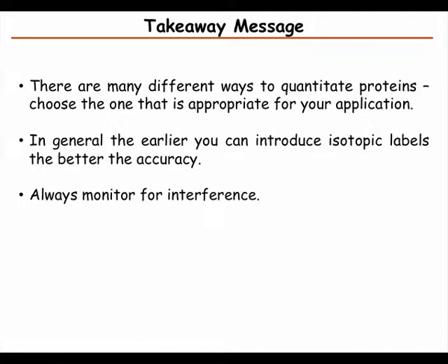And so to summarize in a different way, there are many different ways to do quantitation, and some are more appropriate for some applications than others. It's also often a question of cost and time, how long it will take, because one can always design an experiment so that it will take a very long time to analyze each sample, but then if one has many samples, one has to make a trade-off so that it's doable within the time that's available.